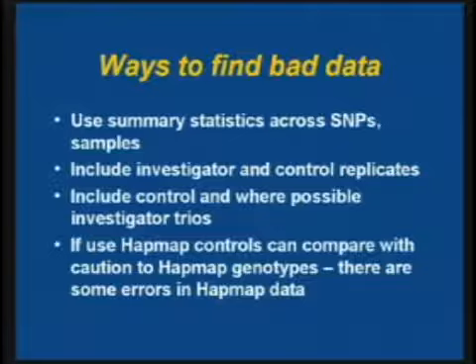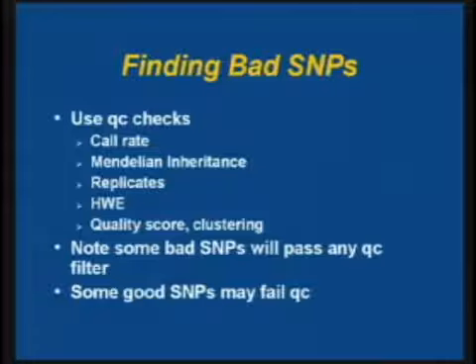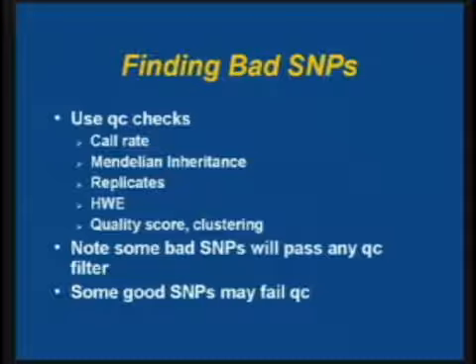Finding bad SNPs: QC metrics include call rate — did most samples get called for this SNP? Mendelian inheritance — if you have trios, did the child inherit one allele from each parent? Replicates — did it type the same way twice? Hardy-Weinberg equilibrium — are the genotype proportions close to expected? That's a little tricky; it depends on your population and whether you'd expect it to be in Hardy-Weinberg equilibrium. There are also quality scores and clustering metrics for many platforms. There are some bad SNPs that will pass any QC filter, and some good SNPs that might fail — it's always a trade-off.